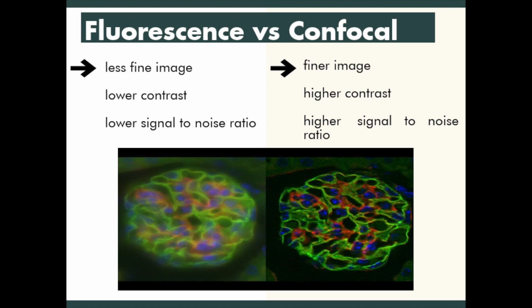All parts of the specimen in the optical path are excited at the same time and results in fluorescence being detected by the microscope photodetector or camera, including a large unfocused background part. The out-of-focus light can reduce resolution, and hence confocal images have a better resolution and a higher contrast than that of fluorescent microscopes. Also, the point spread function removes out of focus.